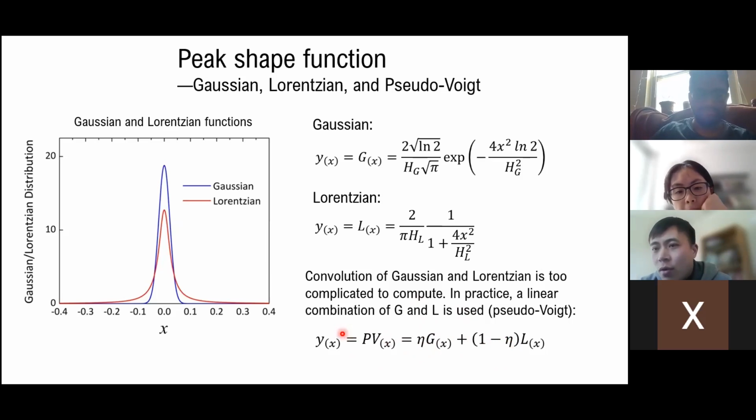It may sound simple, but as I will show later, we need to keep in mind that in practical analysis, this is actually two-theta dependent, meaning that for all the peaks, this eta is not the same. This eta is actually evolving, and we'll see at least what trend it should be following during the evolution of this eta.